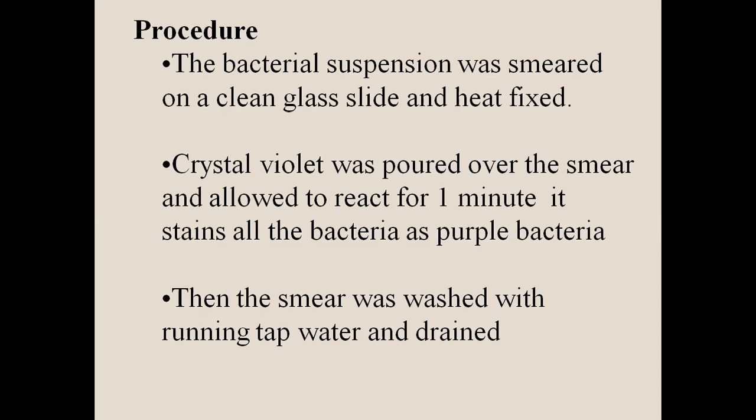Then you wait for 1 minute so that the crystal violet is allowed to react. Once the crystal violet is added, it stains all the bacteria purple. Why? Because the crystal violet is purple in color, and it is the primary stain.